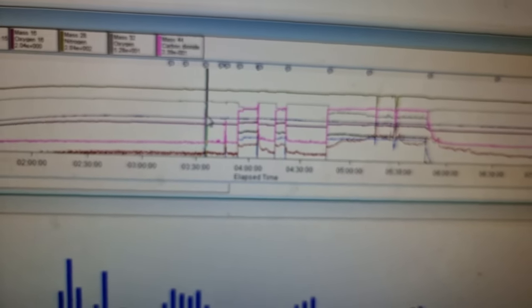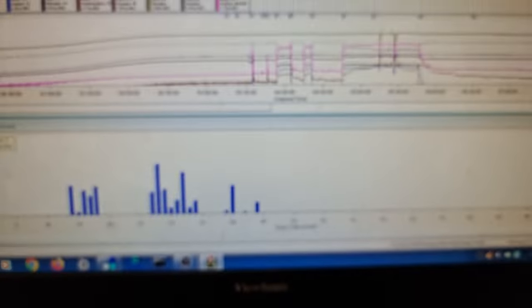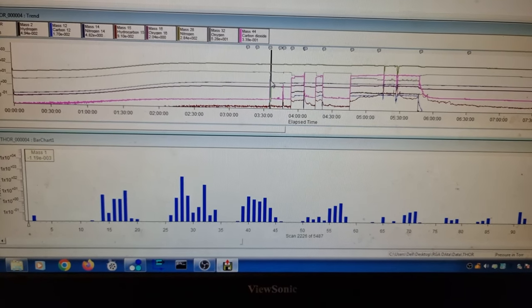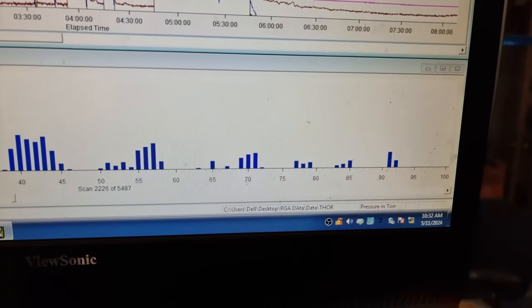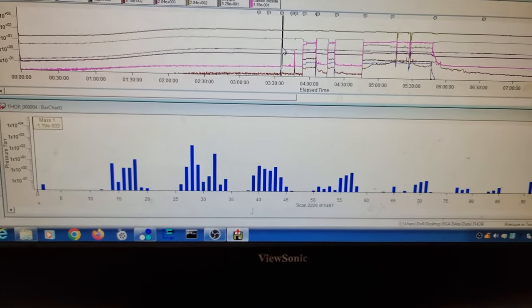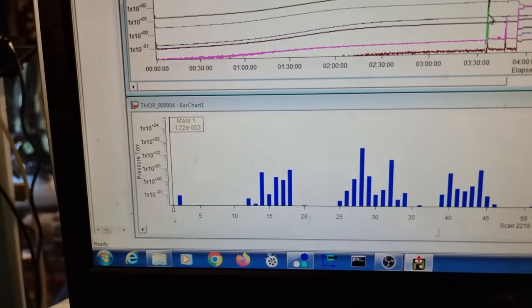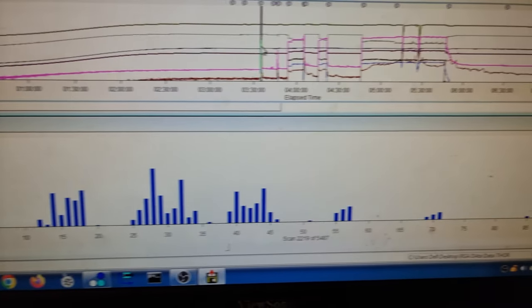If you go here you can see what happens is that as soon as you turn the engine on, you really don't have fresh air. So when you turn it on quickly you get a whole bunch of unburnt hydrocarbons — that's all those signatures. Petrol is around mass 117 or something. You also get some hydrogen down here, and that hydrogen is likely unburnt hydrocarbons being split in the filament of the mass spectrometer.